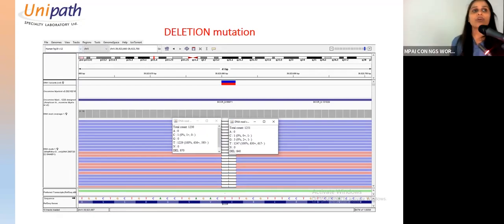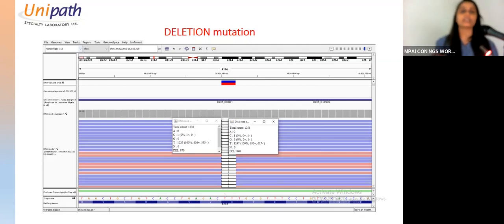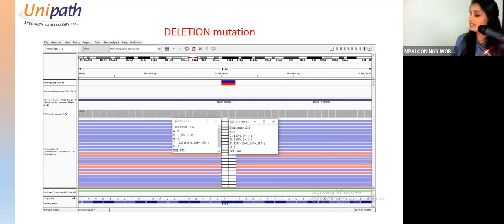So now when you have predicted that with the pathogenic, it is matching with the phenotype, and this also seems good. If the quality is bad, here also you will see mutation, insertion, deletion. That means it is poor quality, and you can trace that here. But here, as you can see, these reads are so clean. So in quality terms also, it is good to go with. So you can report this variant now.